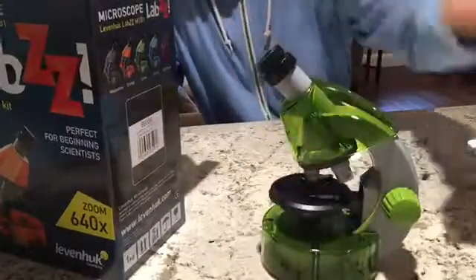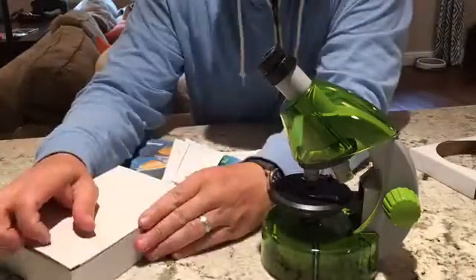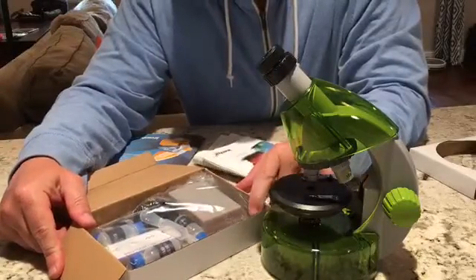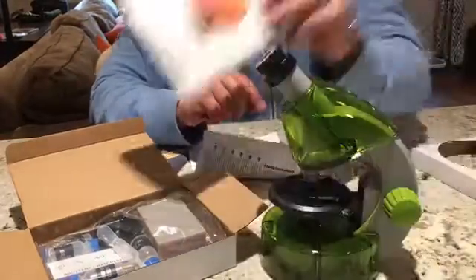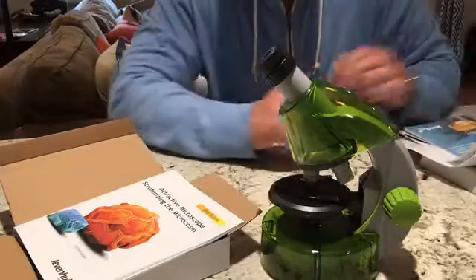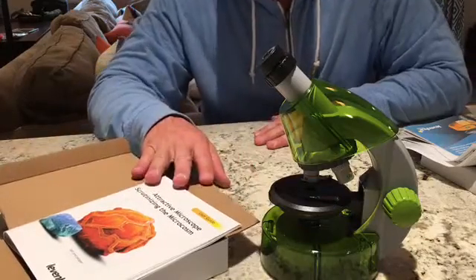Here is what's included inside. There's the microscope — sort of a funky, atypical look to it, not the microscope I'm familiar with, but I don't doubt that it's cool. Included is an experiment kit. I appreciate the fact that it includes the batteries and the LED that lights the microscope. There is an experiment guide that walks you through some things, so even if you don't know that much about it, it's going to walk you through what you need to do to do some pretty cool stuff.